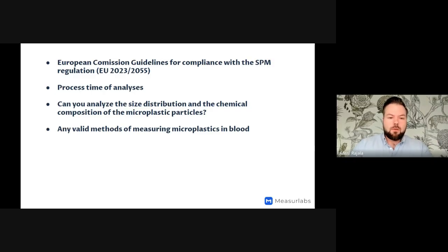Then the comparability of FTIR and Raman results. This is actually a bit of a complicated topic, but a vibration that is strong in the FTIR is often quite weak in the Raman or even absent, and vice versa. So depending a bit on the plastic, some have better signal in FTIR and some might be better in Raman.